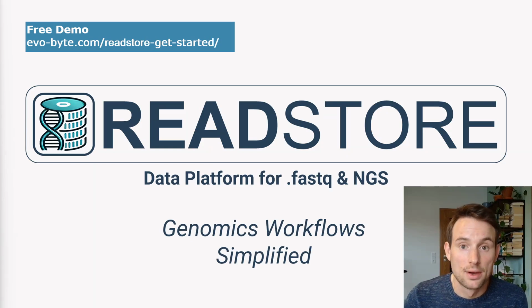Welcome to this introduction of ReadStore, a genomics data platform that allows your team to focus more on analyzing data and generating insights instead of managing FASTQ files and metadata. My name is Jonathan. I'm going to walk you through this session.